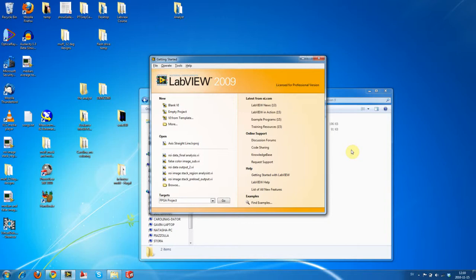This material will also be covered in a future course if we so need it, if we want to look at more advanced handling of data, because for this course we're trying to introduce the basics using this ROI analysis, but there are so many more things that we can do.